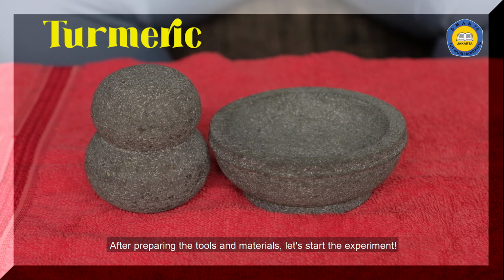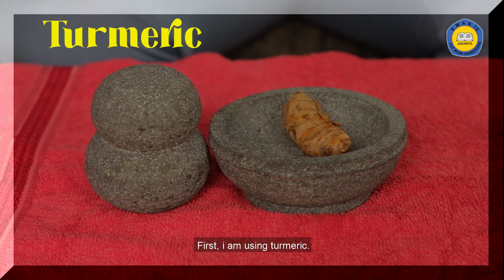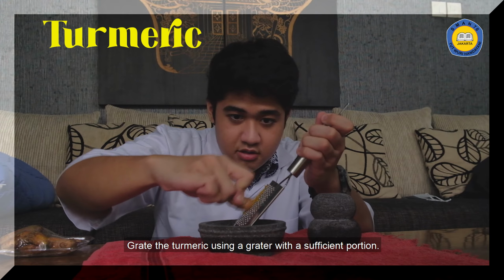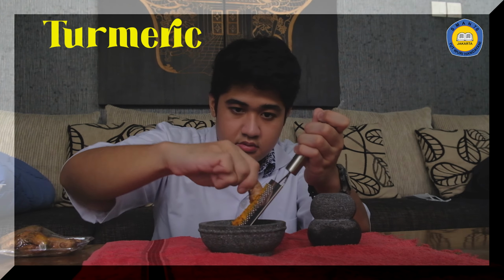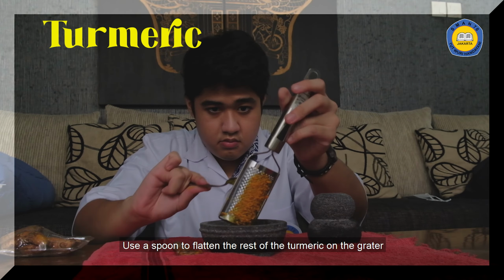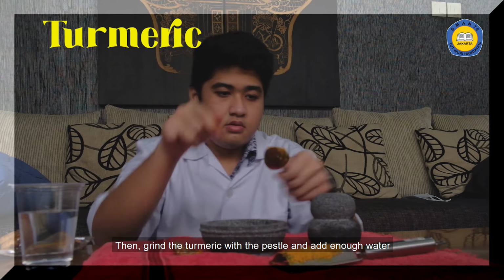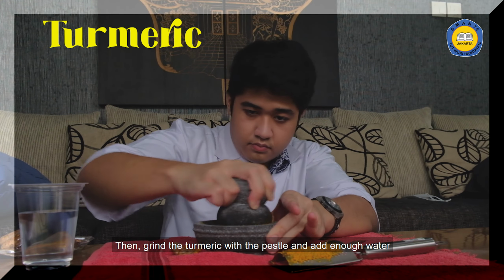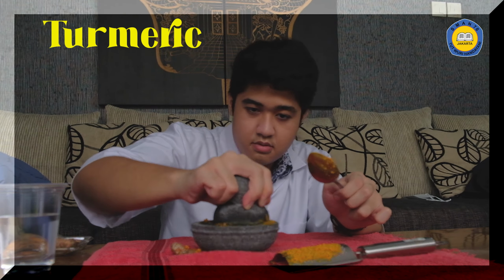After preparing the tools and materials, let's start the experiment. First, I'm using turmeric. Grate the turmeric using a grater with a sufficient portion. Use a spoon to flatten the rest of the turmeric on the grater. Then, grind the turmeric with the pestle and add enough water. Keep grinding the turmeric until soft.